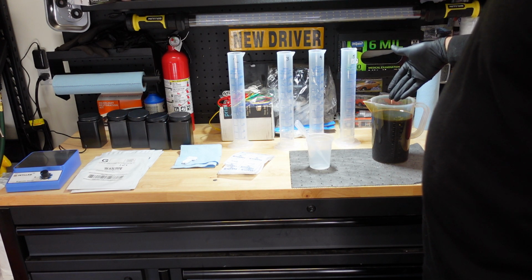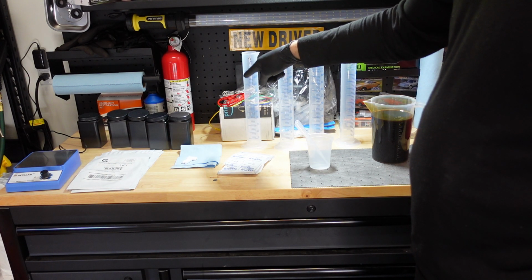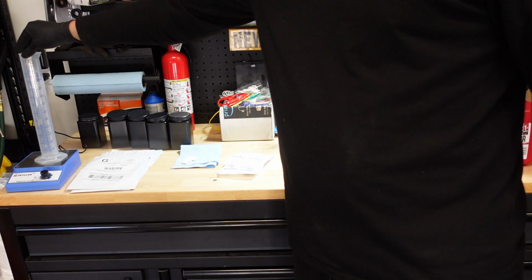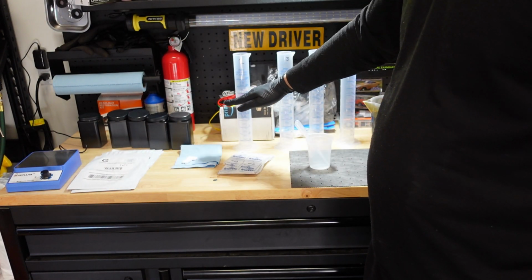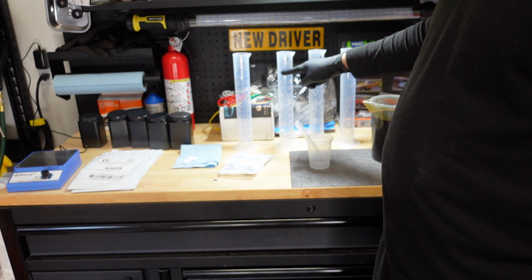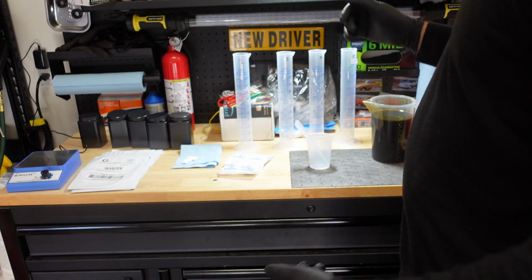We're gonna put 220 mLs of oil in number 2 here, and add 30 milliliters of gas to that, and that's gonna make 12% gas. Then we'll set that on the stir plate and stir that up thoroughly. Then we will cut this in half, take 125 mLs from here, add it to 125 mLs of oil with no gas, and keep doing that until we get down from 12% to 6%, 3%, 1.5%. Okay, let's go.